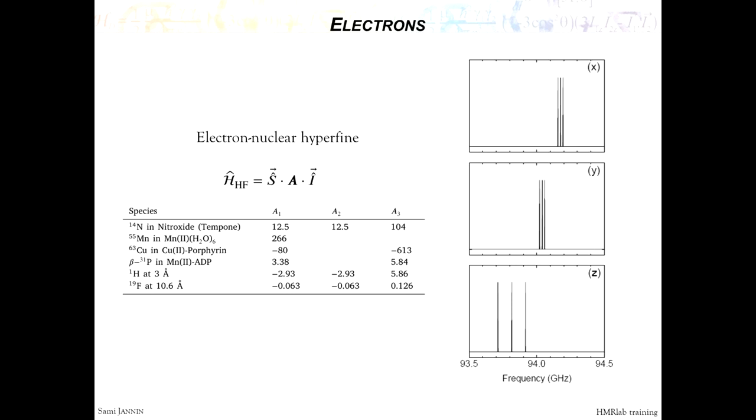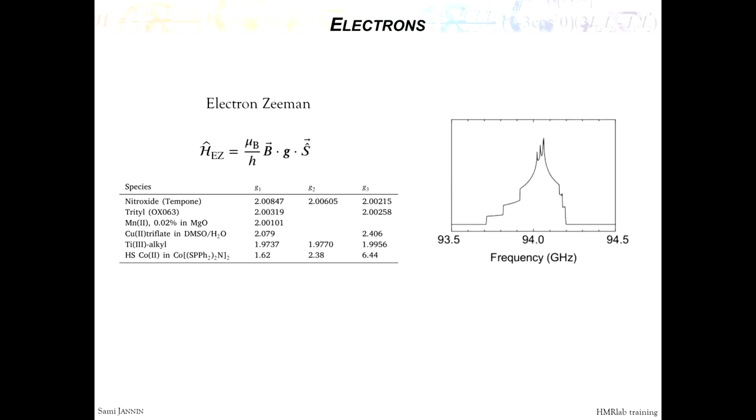This is in one axis, this is in the other axis. So you see the splitting changes a lot in amplitude. This is if you have a crystal, but in reality we have a powder, a glass. So you have all the orientations. And that gives rise to a broadening. We have all the possible combinations of orientations, and this gives rise to a broadening.